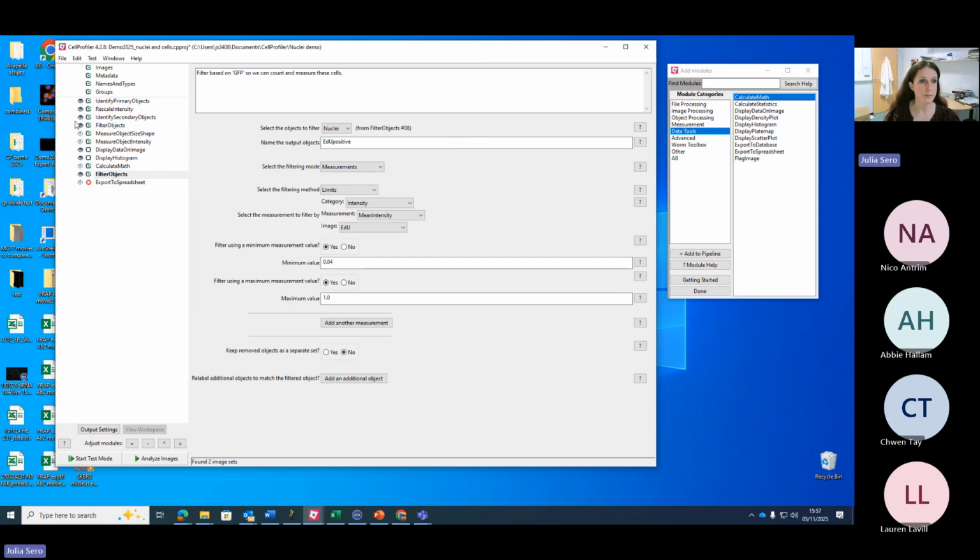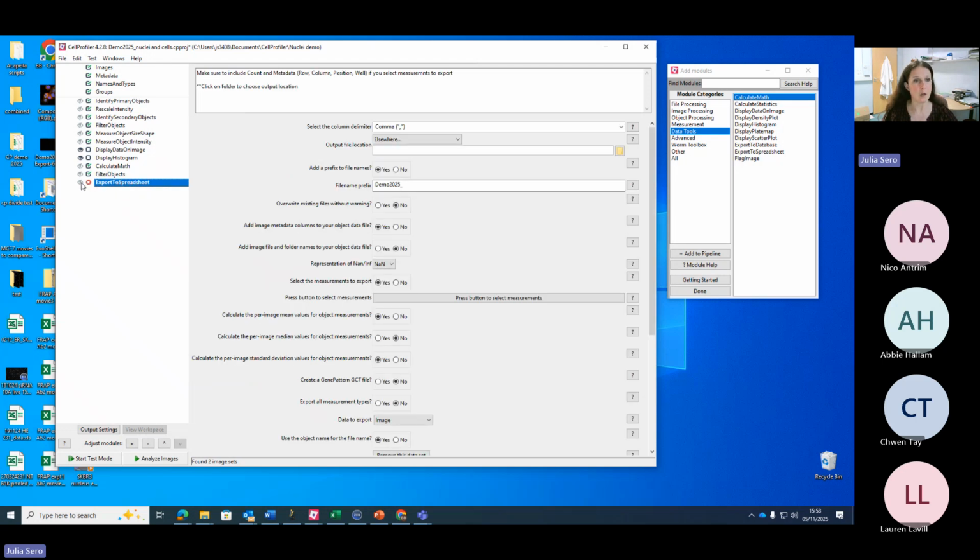So I'm going to leave the test mode. If I was going to run analyze images and start the batch analysis, I might want to untick these boxes. Actually, these little eyes could be left open because we're not actually running these. If you leave the little eyes open, it's going to give you a pop-up window with every image set, which might make it take a little bit longer, or you might not want to see that because you're doing something else. So we've got a little X here. If you hover over, it can give you some information about why it's not happy. So here, pretty obviously, we haven't actually told it where to save the data.